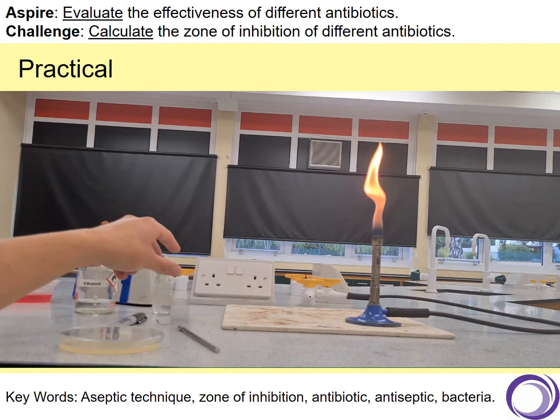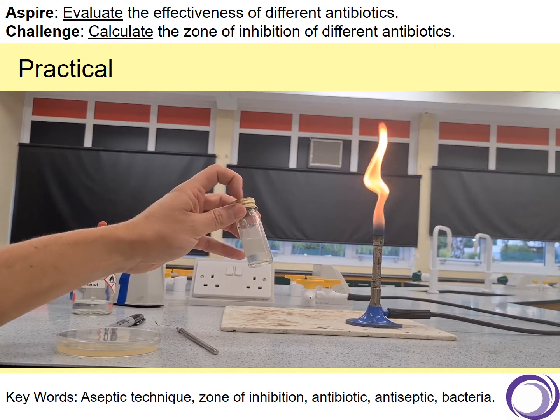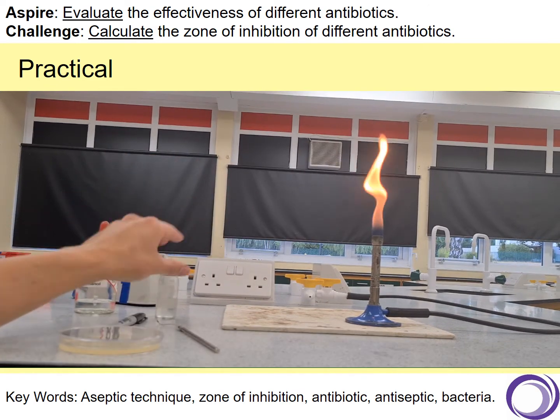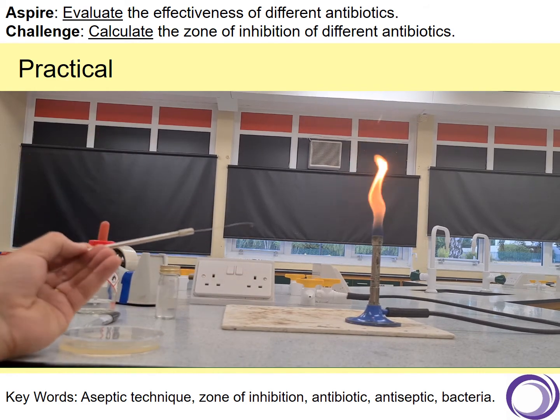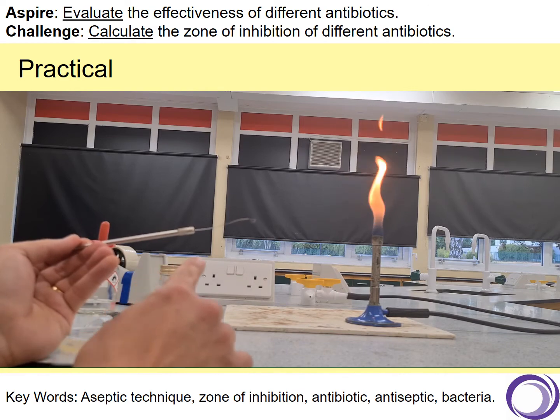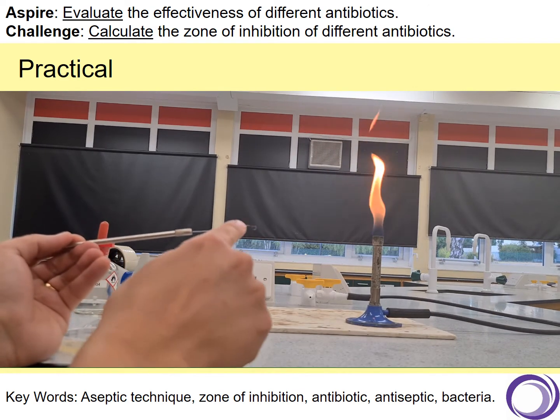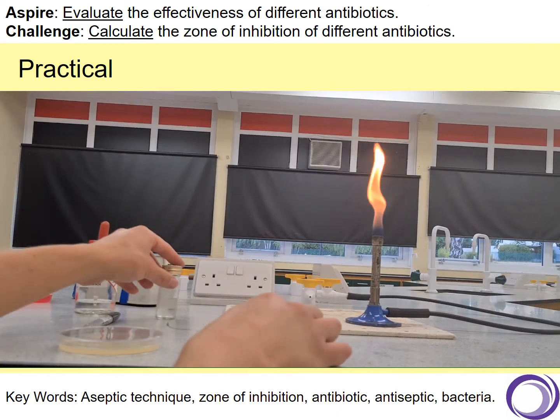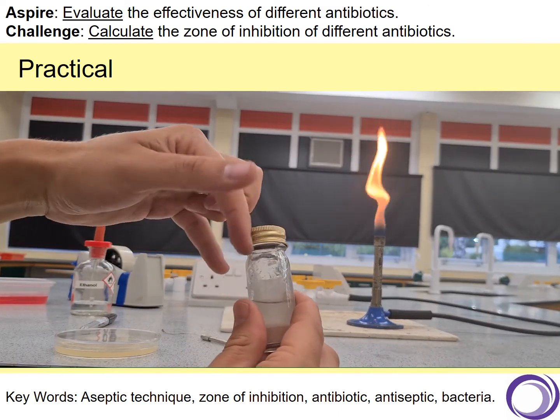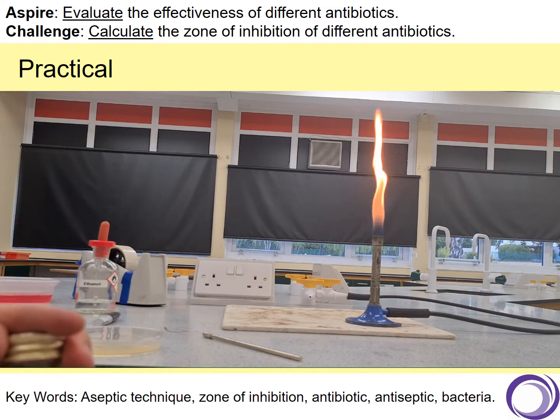So, I know bacteria is microscopic, so there could be bacteria all around this lid here, and there's almost certainly some bacteria that we don't want growing that isn't E. coli on this inoculating loop here. So the first thing I've got to do is sterilize this inoculating loop, and I need to sterilize the top of this lid here. Okay, so in order to do that, I need my Bunsen burner.